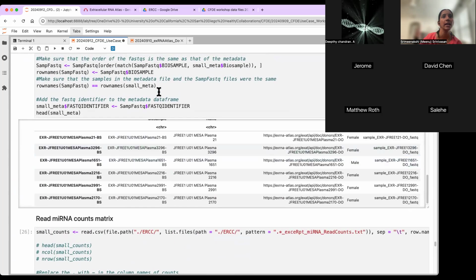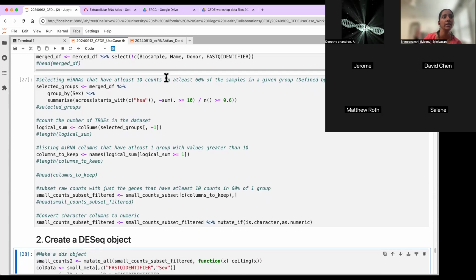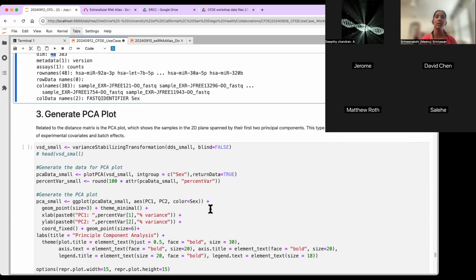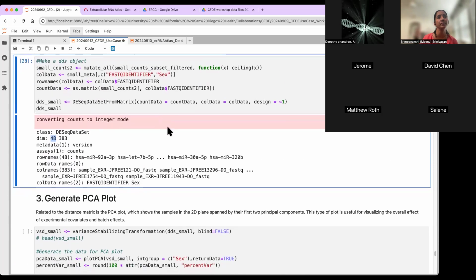This has removed the microRNA, and only kept the microRNA that is present in the DE-seq that we did for the miRNA, mRNA target. So whatever microRNA is in this data set that was present in that target list are the only ones that are kept here. So we are only looking at those microRNAs. Okay, so that's the filtering that we've done over here.